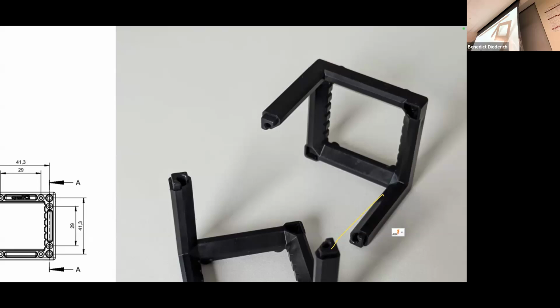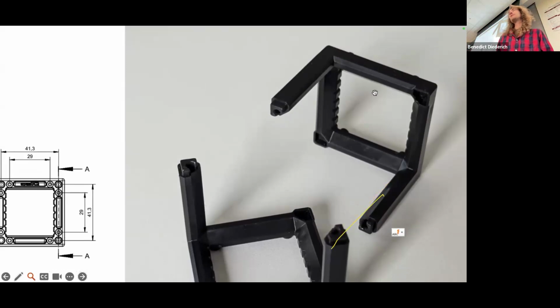That means your optical system has to be very stable. And this is still possible with 3D printing, as you can see later. That's also why we decided to have these grooves, because a laser that is able to bend is not very nice. That's because the mechanical design of this whole thing, if you have a look here, is not ideal. There's no way of putting that straight in. It's also mechanically very much over-defined. That's something we can discuss later, how to improve that.